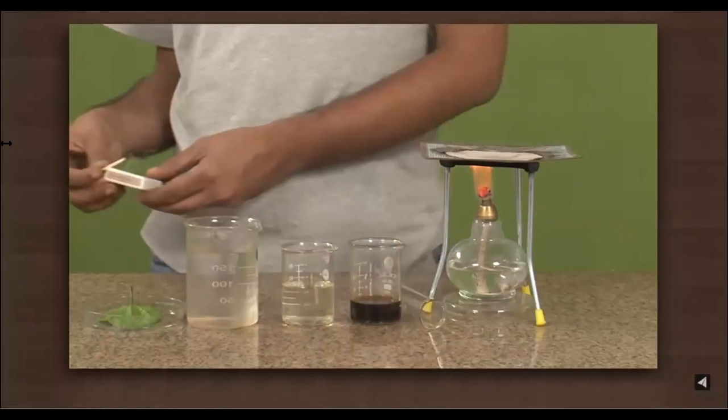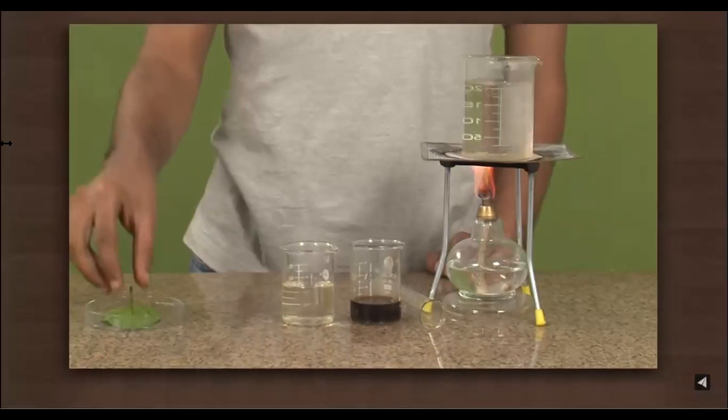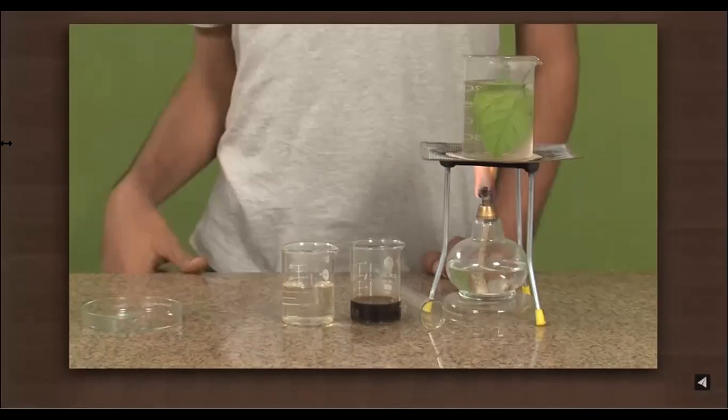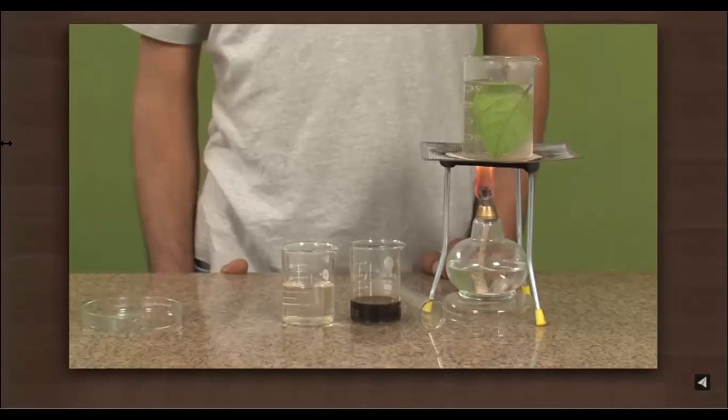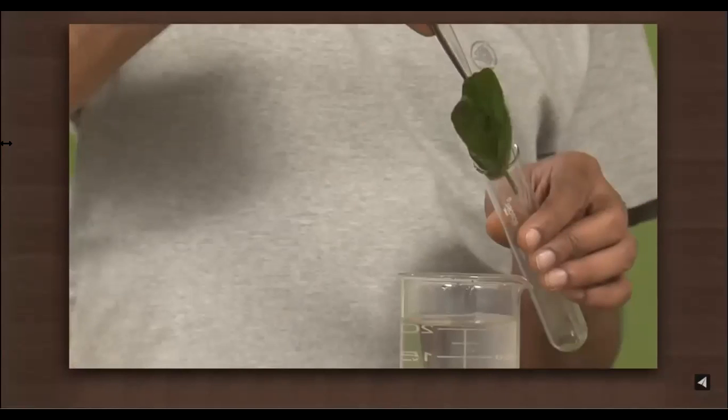Take a leaf from a plant that has been exposed to sunlight for several hours. Place the leaf in boiling water. This will kill the leaf, disrupt the cell membrane, and soften the cell walls, allowing the iodine to enter the cells and react. Now put the leaf in a test tube and cover it with alcohol.